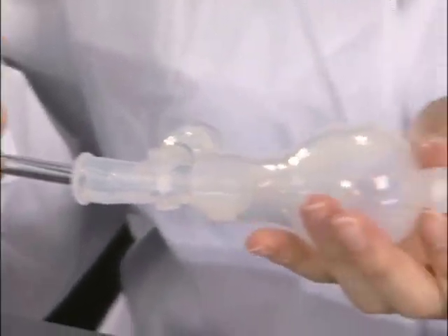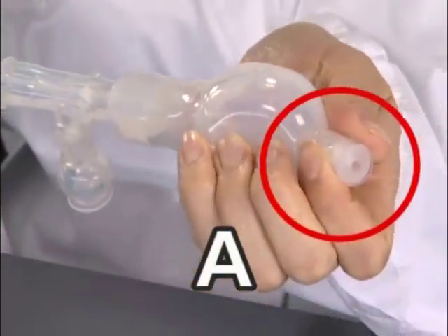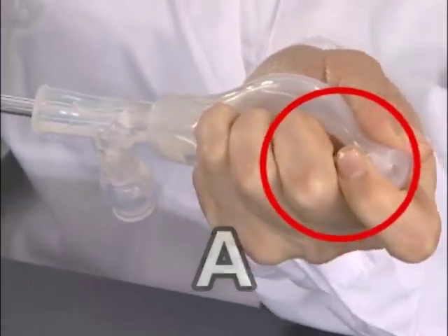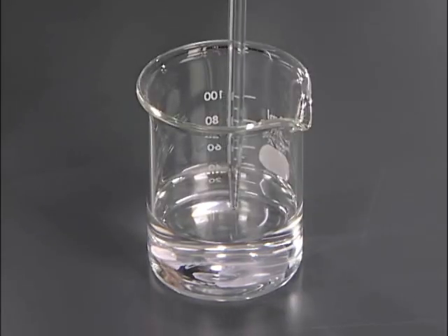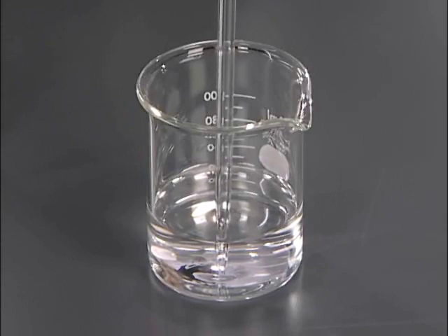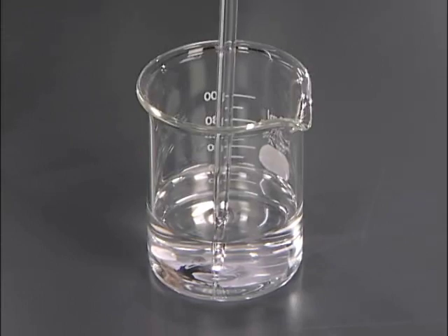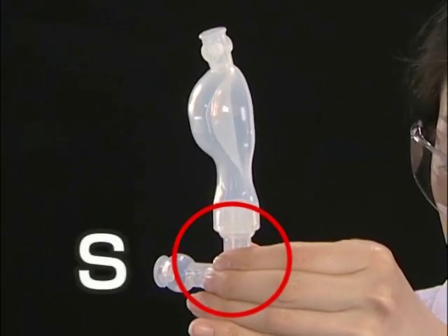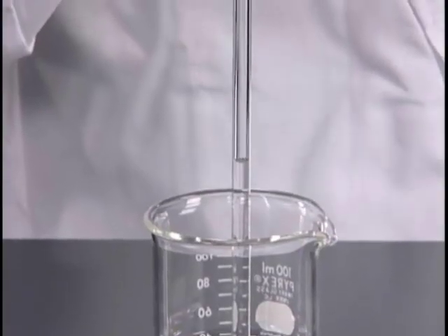Firstly, squeeze the rubber bulb while pressing valve A. Insert the tip of the pipette deeply into the liquid. By pressing valve S, slowly draw the liquid a little above the marked line.